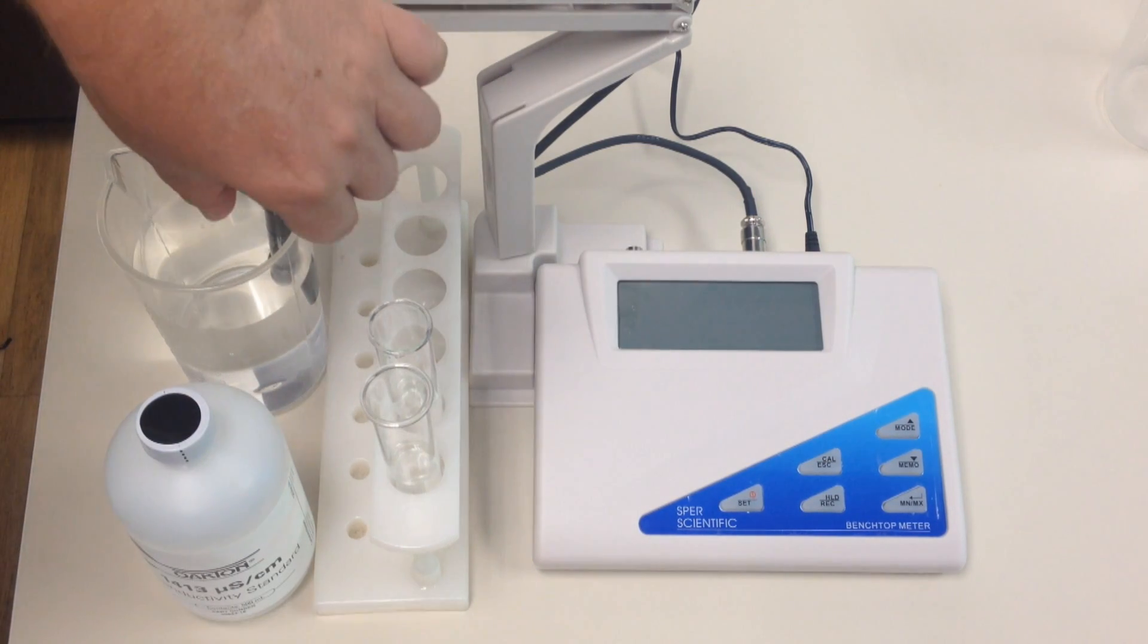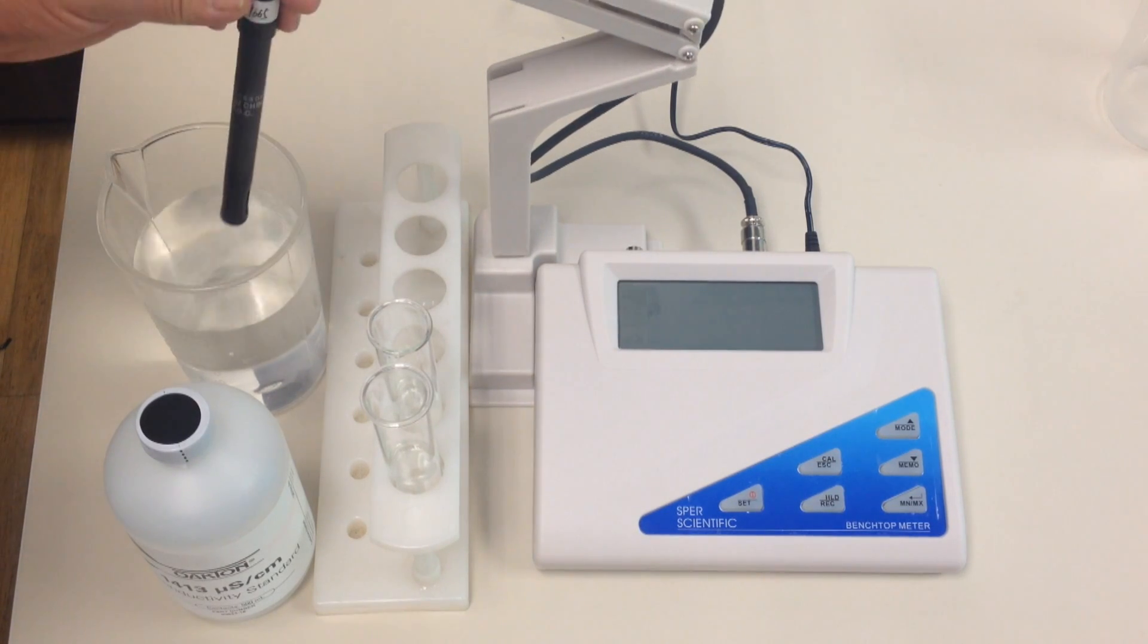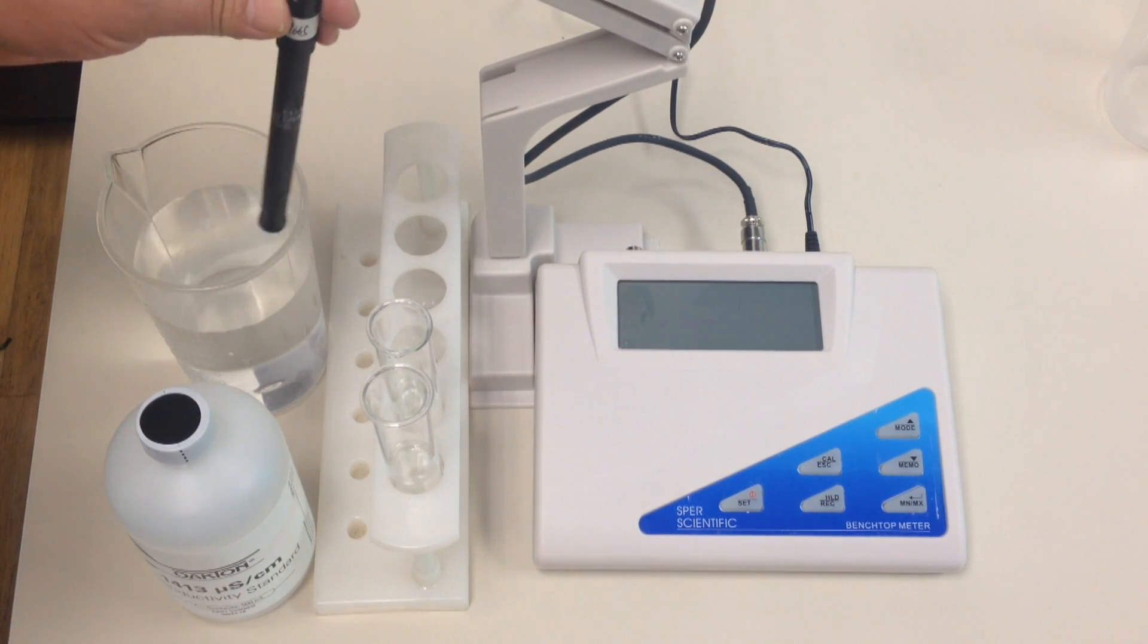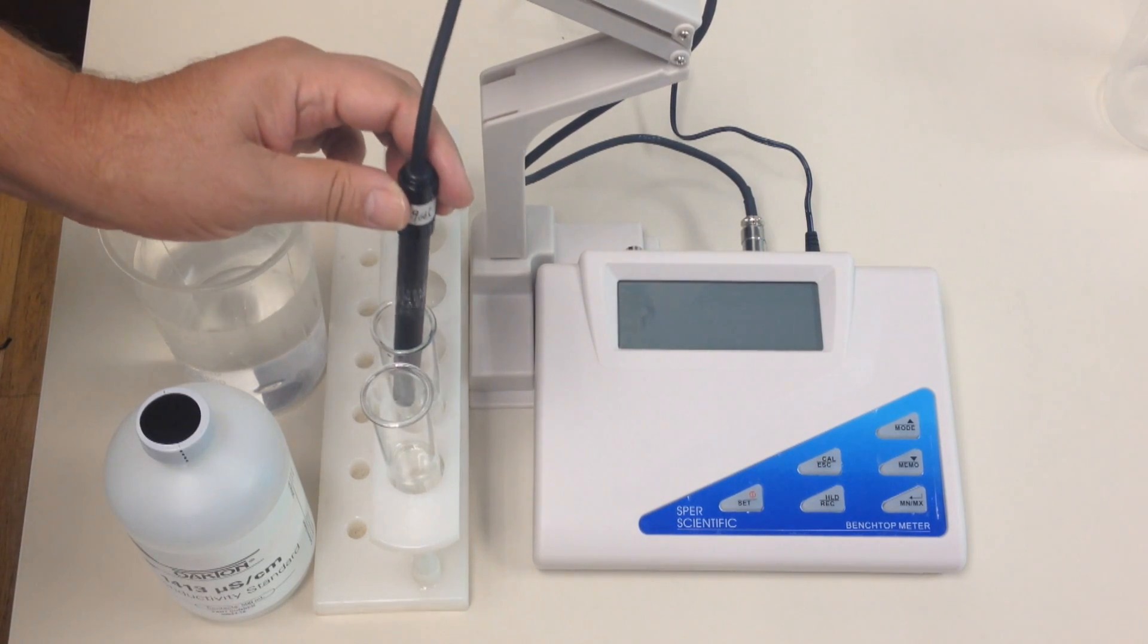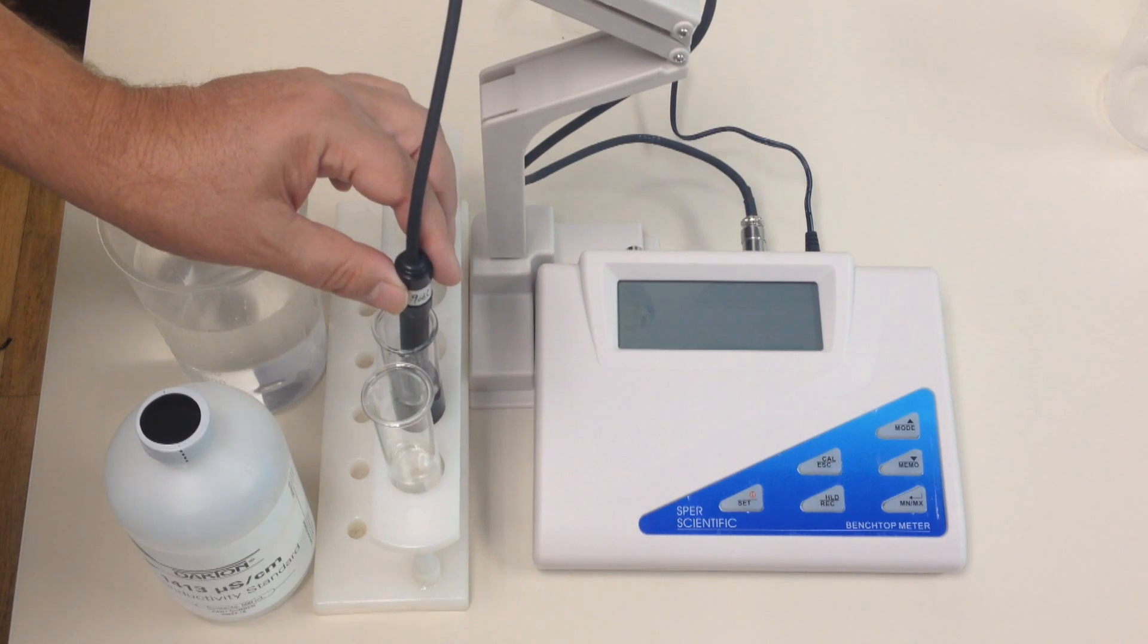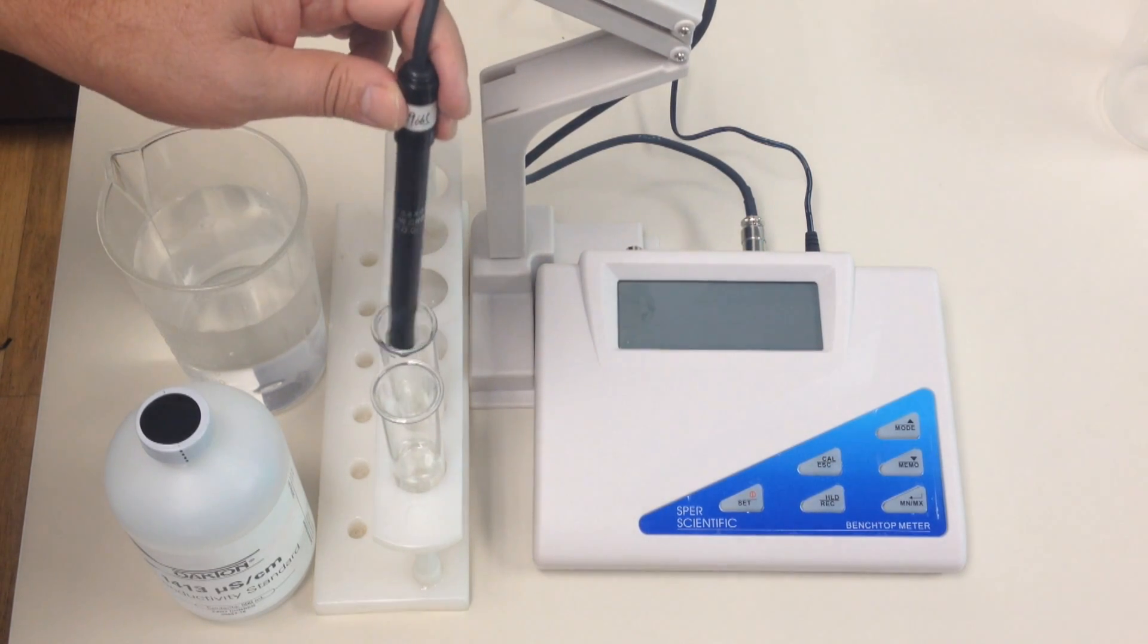So the first thing you do after it's been sitting in for 30 minutes is you take your probe, tap out the distilled water to eliminate as much contaminants as you can, put it into your first beaker, swish it around a little bit, tap it out.